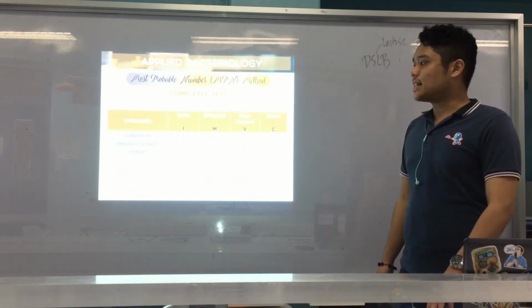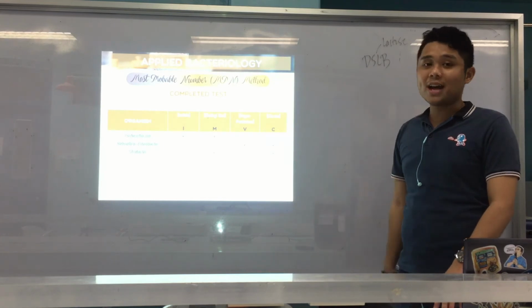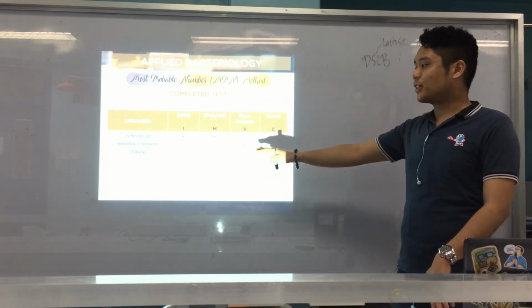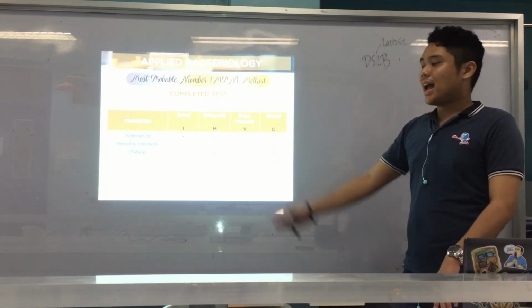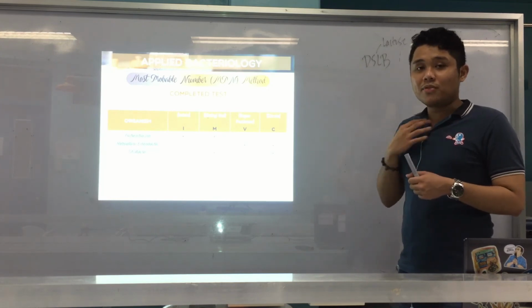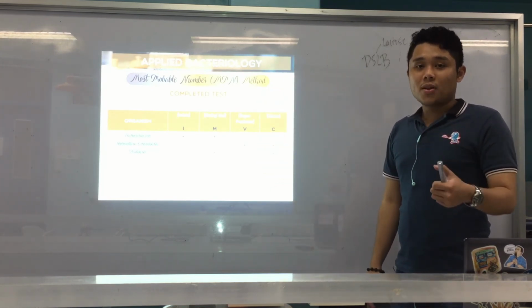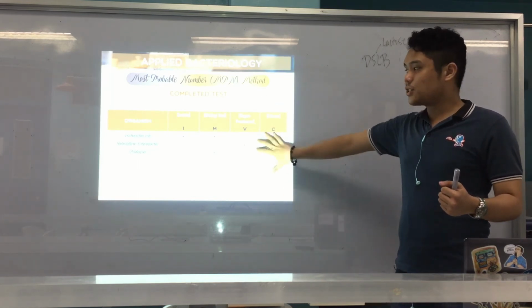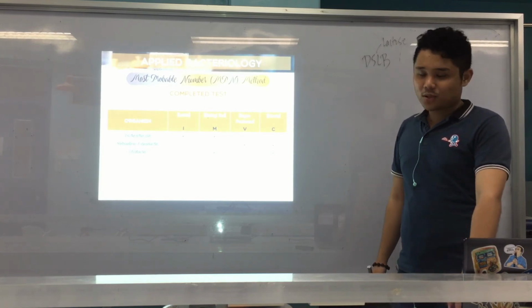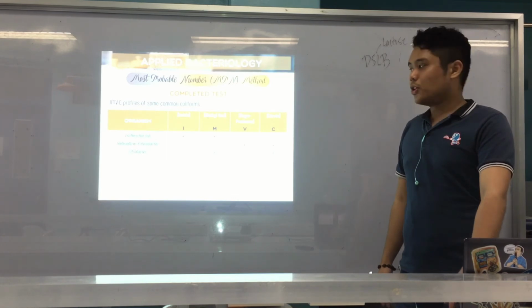So for the completed test, again, your IMVIC, we follow the same: if the organism is E. coli, plus, plus, minus, minus. And for Klebsiella or Enterobacter, negative, negative, plus, plus. And Citrobacter, negative, plus, negative, plus. So we will look for IMVIC because, again, these organisms are usually the indicators that coliforms or fecal coliforms are there. Because, again, these organisms are fecal coliforms. Okay? Alright. So that's for MPN. So again, the IMVIC profile of some common coliforms.